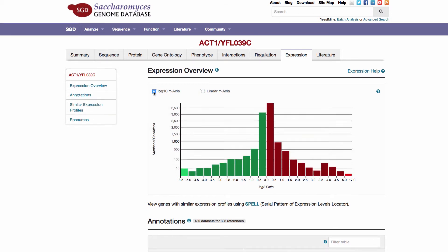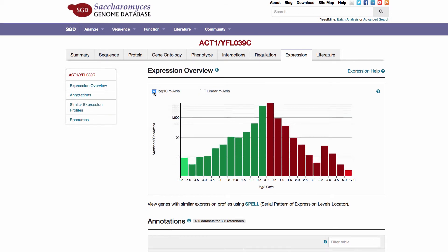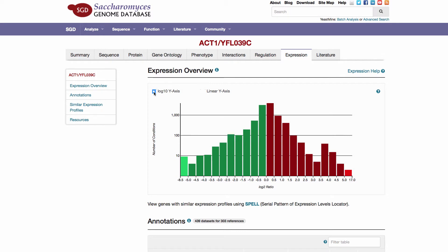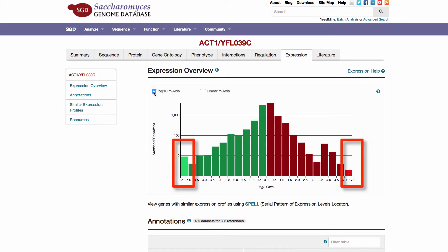Based on the length of the tails at the expression extremes, the size of the upper and lower range groupings have been increased and highlighted with bright colors.